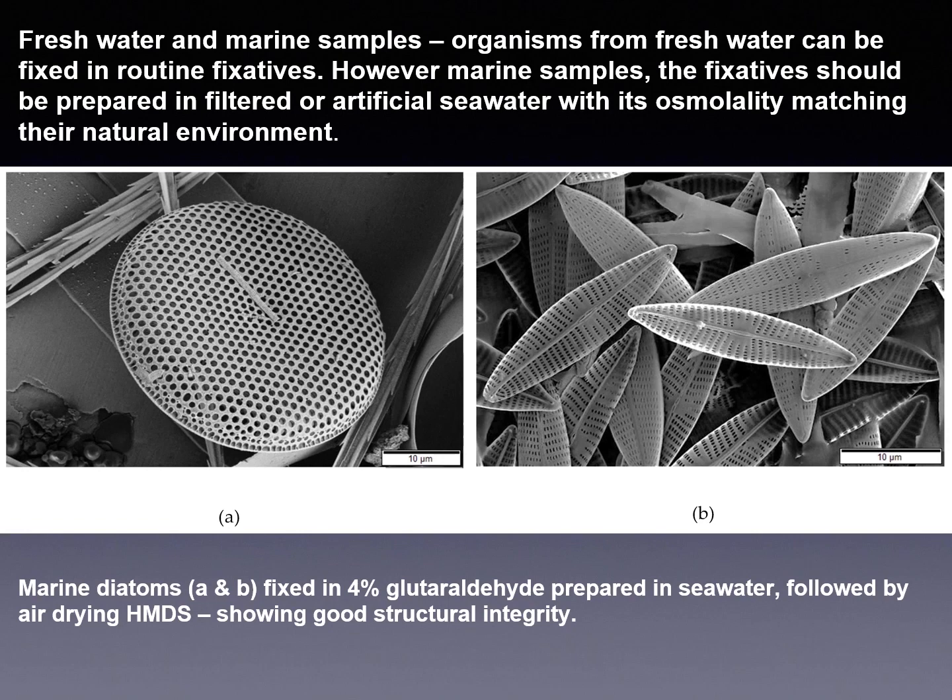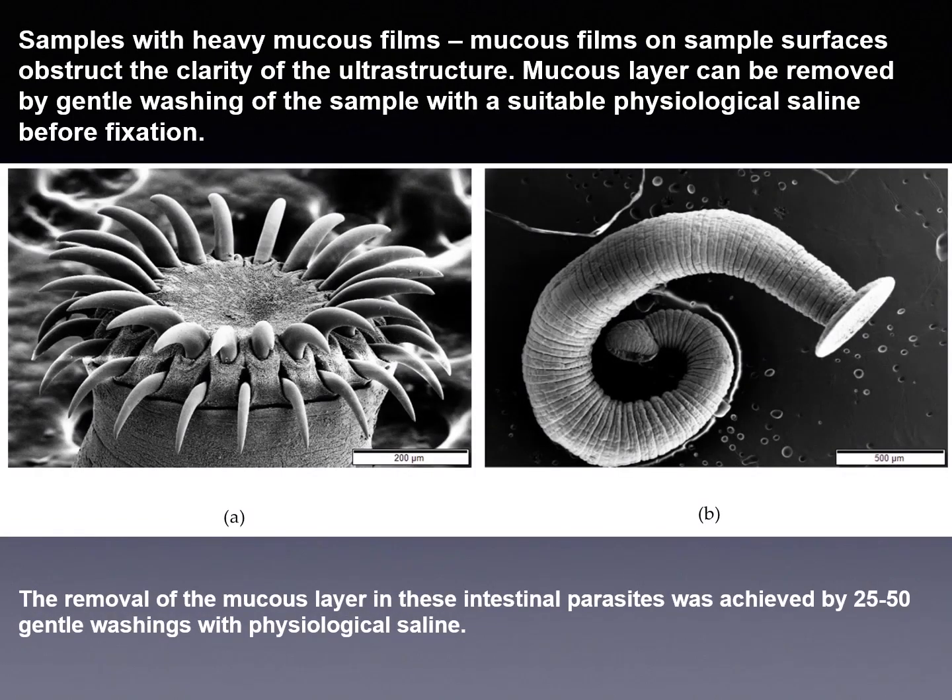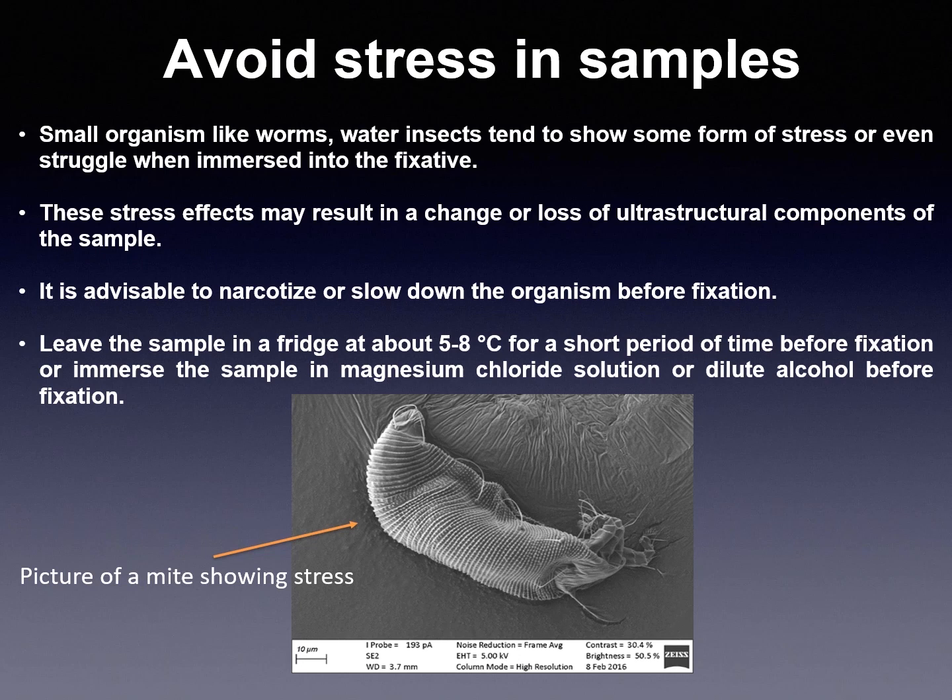In our picture, we see that freshwater and marine water samples like diatoms can be fixed in routine fixatives. However, for marine samples, the fixatives should be prepared in filtered or artificial seawater with osmolality matching their natural environment. Samples with heavy mucus layers obstruct the clarity of the outer structure. Mucus layers can be removed by washing the sample with suitable saline before fixation. In images A and B, we see the removal of the mucus layer in these intestinal parasites.